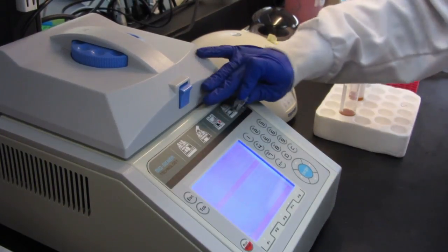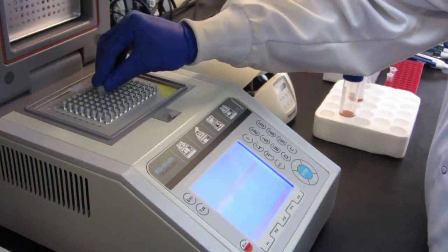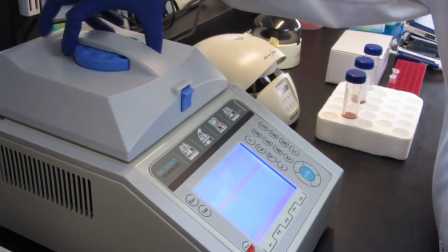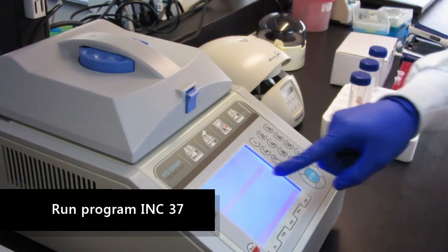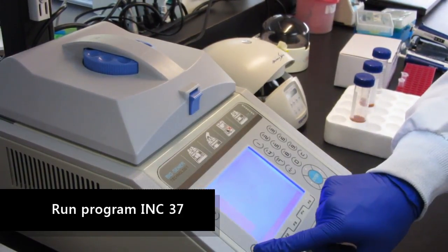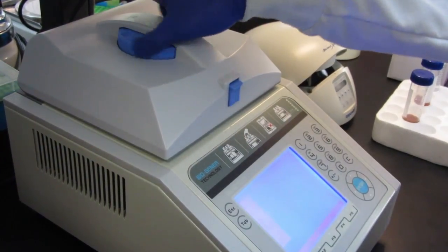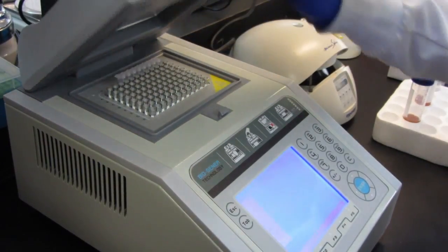After resuspending sample in PCR buffer and lysis solution, incubate the tubes in a thermal cycler using the pre-PCR lysis conditions. Using the thermal cycler, you will want to open and run program INC37 to start the lysis reaction. After the run is completed, take your sample tubes out for the PCR amplification step.